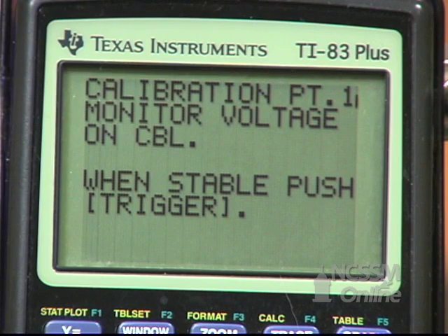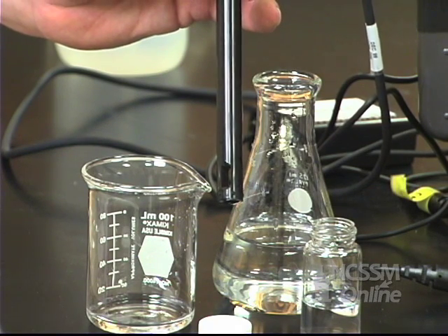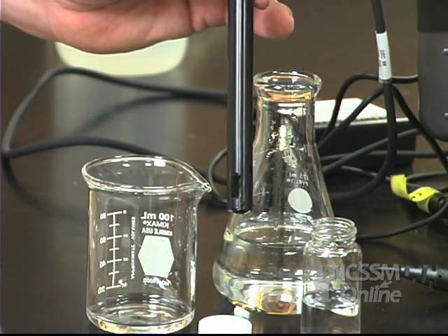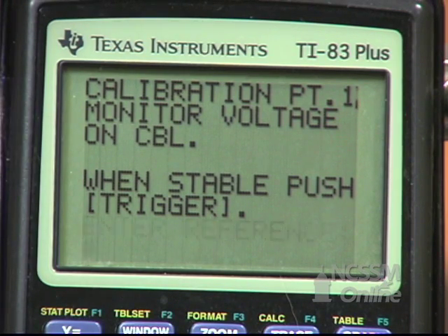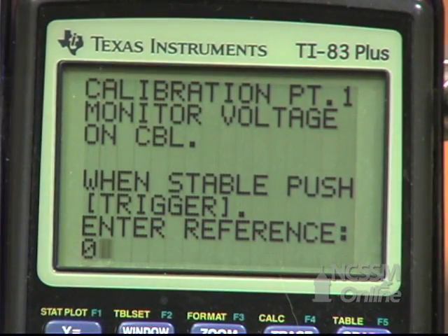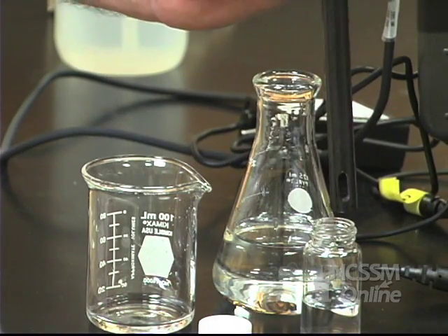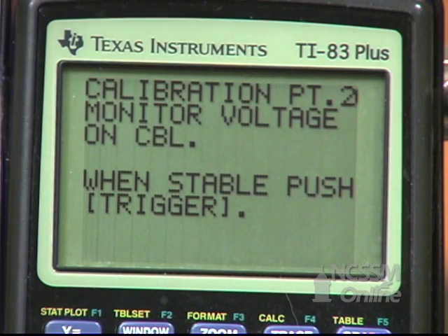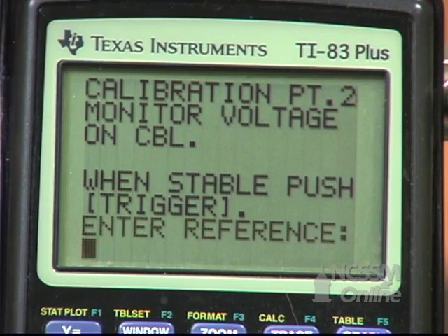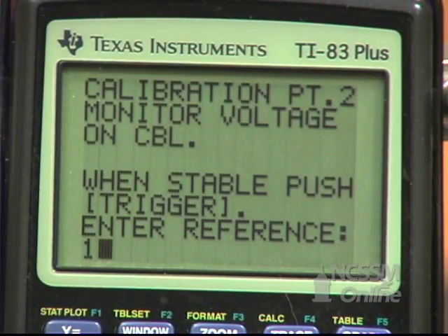For the first point, remove the conductivity probe from the distilled water — the first point will be measured in air. Wait for the reading on the CBL to be stable, then press Trigger on the CBL and enter a reference value of 0. Then place the conductivity probe in the standard solution, wait until the CBL reading is stable again, press Trigger on the CBL, and enter a reference value of 1,000.